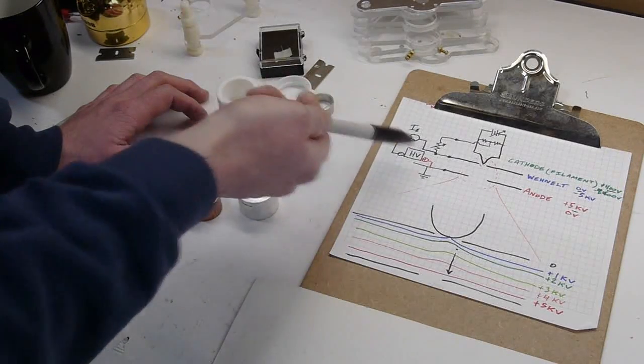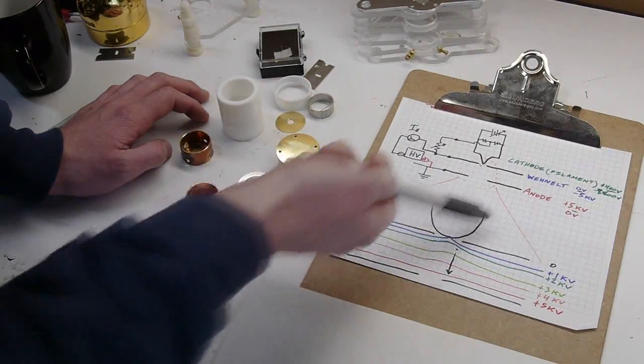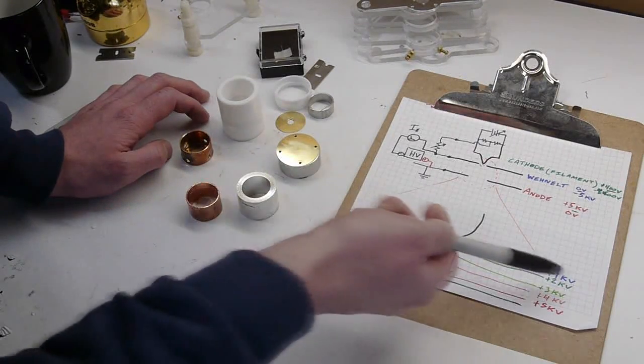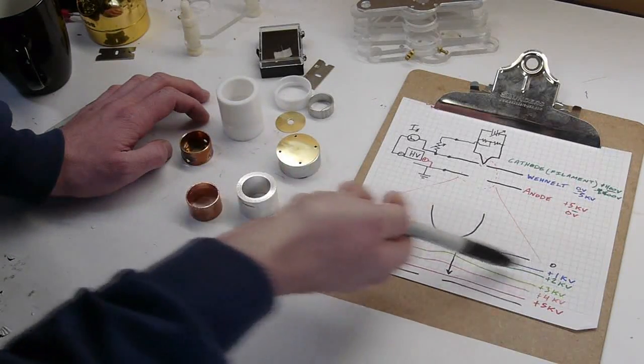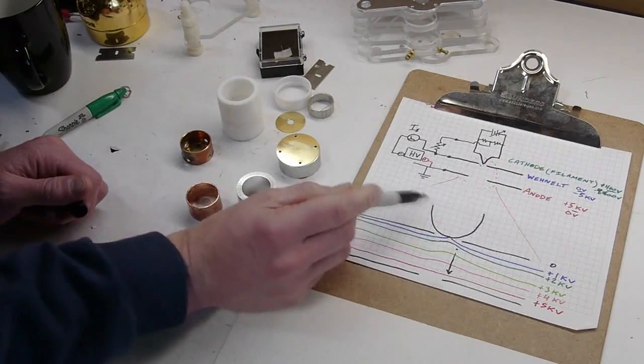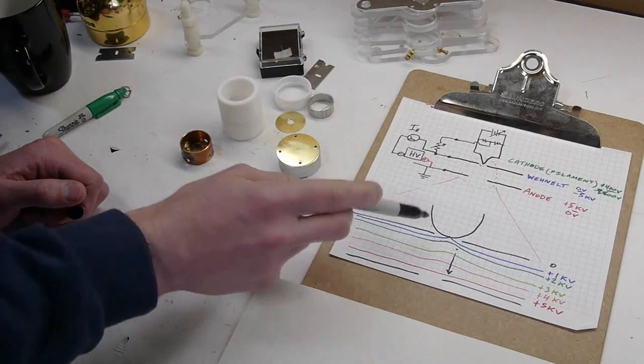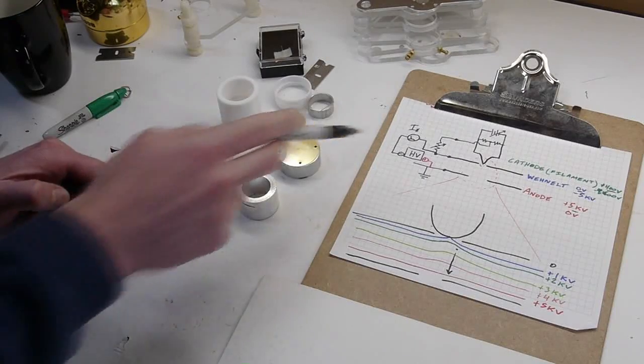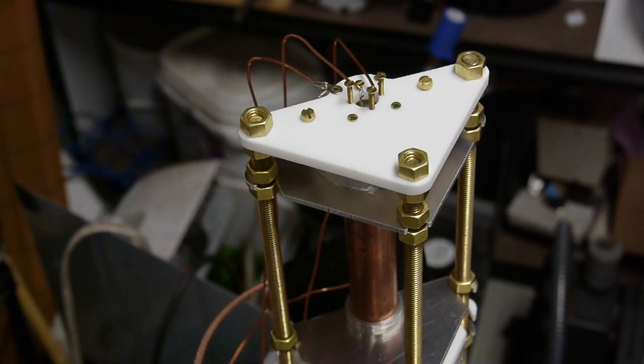So if this is two megaohms, the filament voltage might be something like 400 volts higher than the Wenelt. And that causes the field to look like this, where there's sort of like a dip in there. And electrons that are boiled off in a region where the dip touches the filament actually make it down into the field and are accelerated. And electrons that are boiled off over here on the side, they don't get sucked in. They actually get pushed back into the filament or they just stay in a cloud around here. So it's a self-regulating, adjustable, self-regulating electron gun.